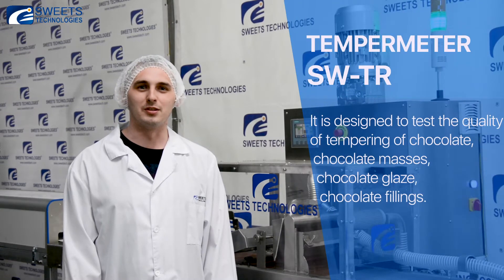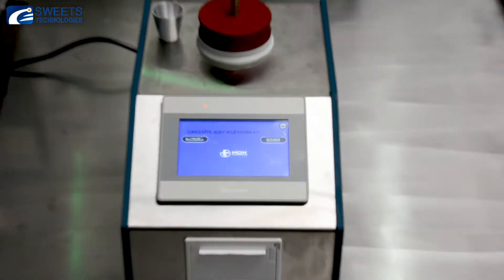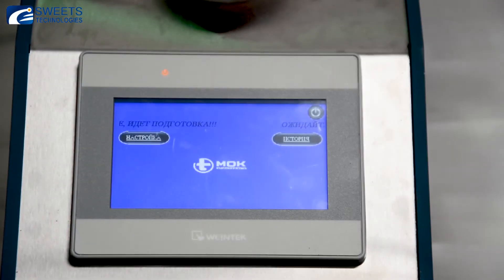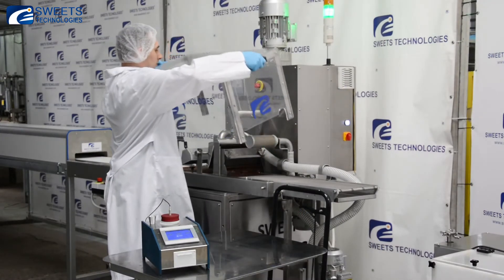Hello friends! Today we will demonstrate the operation of the temperameter. It is designed for testing the quality of chocolate tempering, chocolate masses, chocolate glaze, and chocolate fillings. The operation of this temperameter is based on analysis of the cooling rate curve of the tempered chocolate mass.